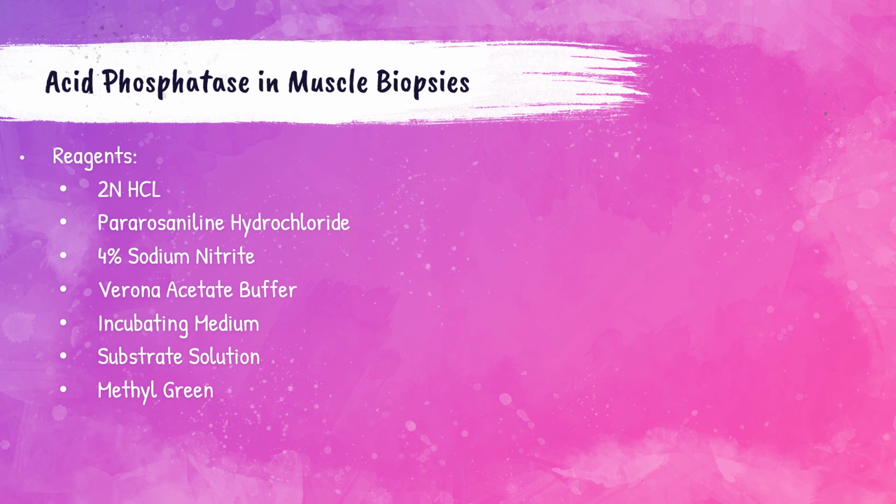The reagents needed are 2 normal hydrochloric acid, pararosaniline hydrochloride, 4% sodium nitrite, Veronal acetate buffer, incubating medium, substrate solution, and methyl green.